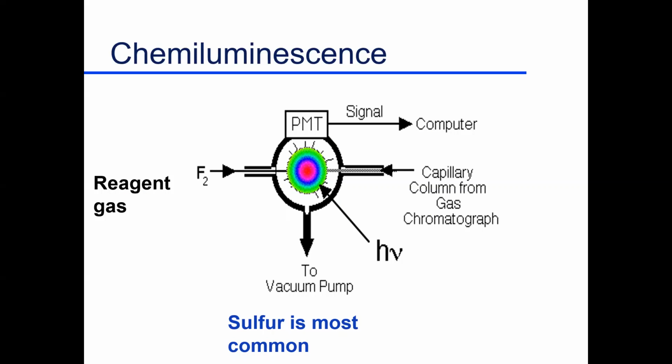Well, I think it's time to get going, so let's go for it. We were talking about hardware, really, what are the parts of a gas chromatograph, a little bit about how they work and so on. We've gone through the most common detectors, and so we've got a couple still to go.